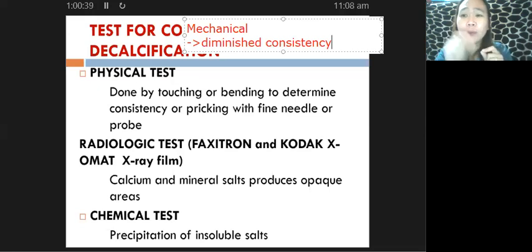If you prick your tissue sample, even if you make use of very small, very fine needles, there would always be the presence of needle track artifacts.